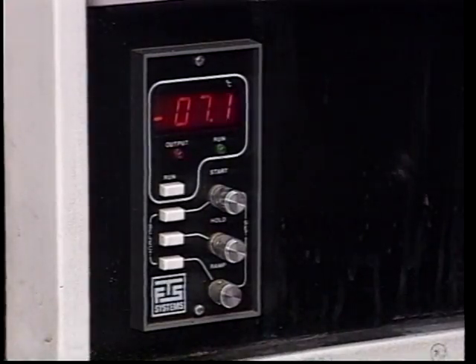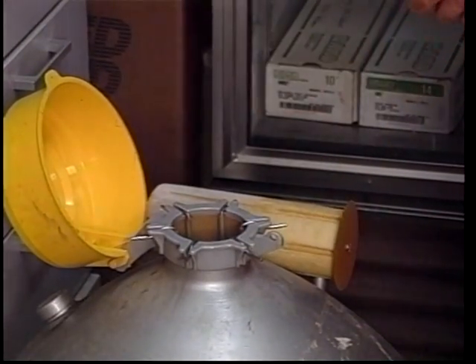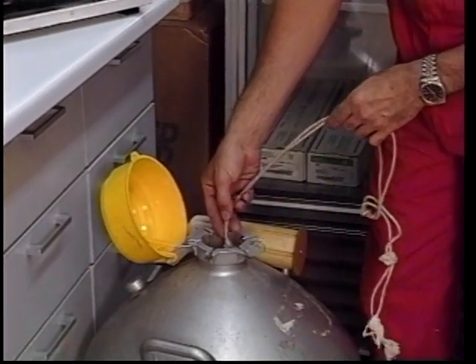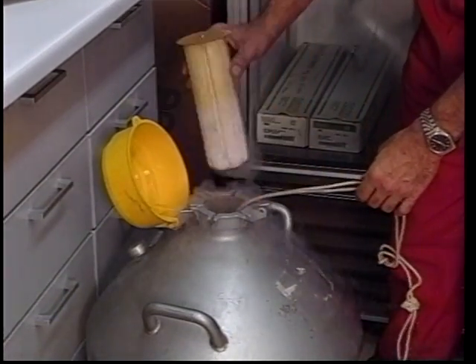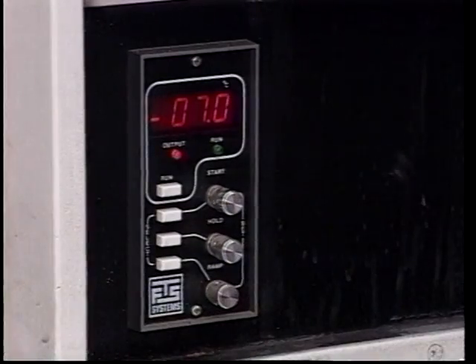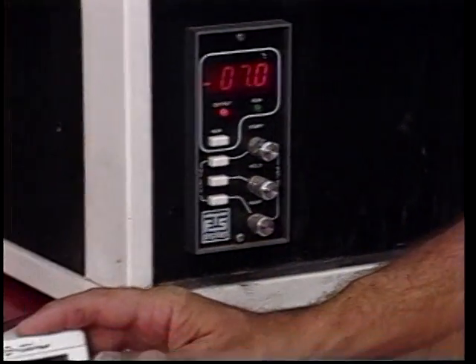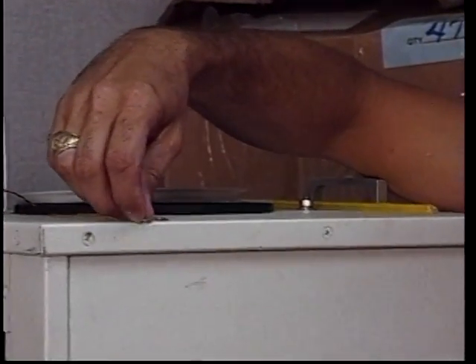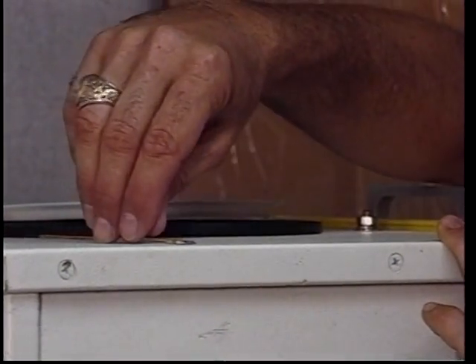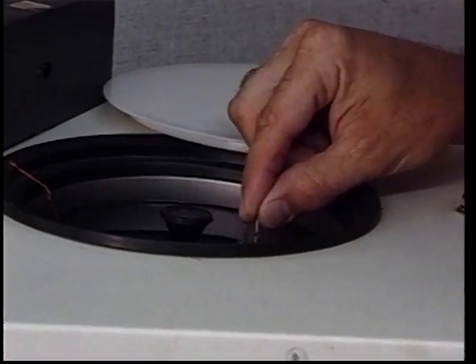While the freezer is cooling, we need to place a brass rod into a liquid nitrogen tank in order to seed or induce ice crystals in the embryos. Once the program reaches -7 degrees centigrade, it's ready to place the embryos into the freezing unit. The embryos need to be placed down into the alcohol bath in an upright position with the cotton plug extending above the level of the alcohol. This will assure that the writing does not become washed off in the liquid.